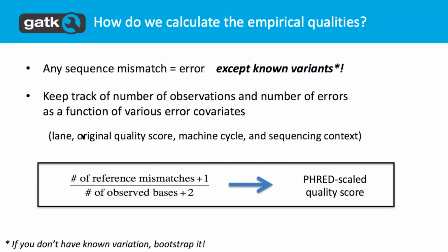Bhanu is going to explain how we mask out real variation, and what I suggest is we go through that explanation, and then after that we can address the question of how that applies to cancer samples. Sound good? Cool. Hopefully the number of variants due to somatic mutation is not as high as all the sequencing artifacts, so that kind of gets lost. But we'll address that.